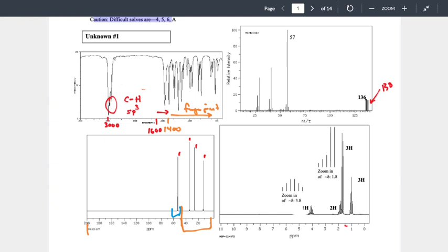Okay? And now that sets us up with this gory, awful table that everybody doesn't like. So we got red, blue, orange, and green is a horrible color to use. Purple. So now what we want to do is start to layer in this next set of information. So within my chemical shift, what I'm trying to do is pull the information out of the graph so I can interpret it without having to worry about what's in the graph.